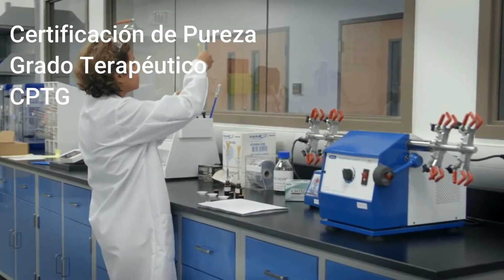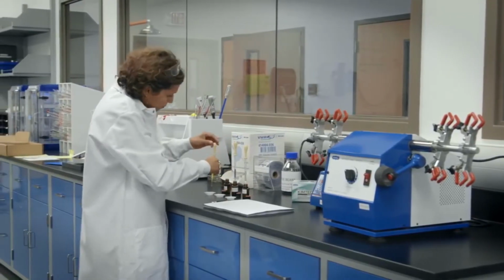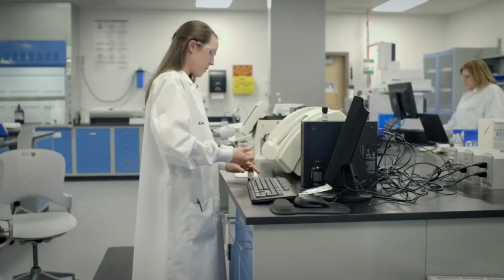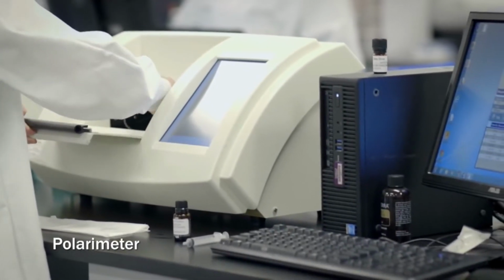After each oil has been identified by GCMS, further identified by FTIR, we actually test the physical parameters of each oil. And then the physical testing is a compilation of quite a few different tests. Optical rotation, in which we use a polarimeter, and that tests the chirality of the molecule. Sometimes chiral molecules can be missed on GCMS, so it's another verification.